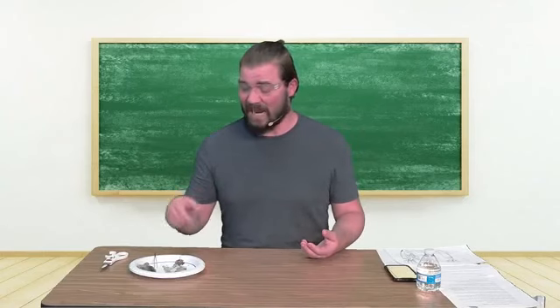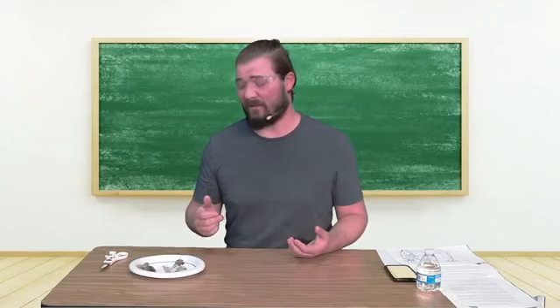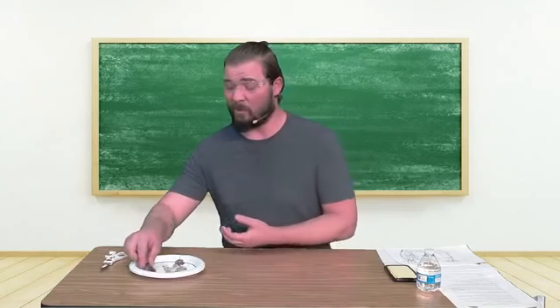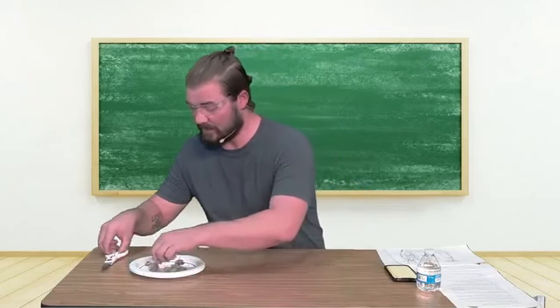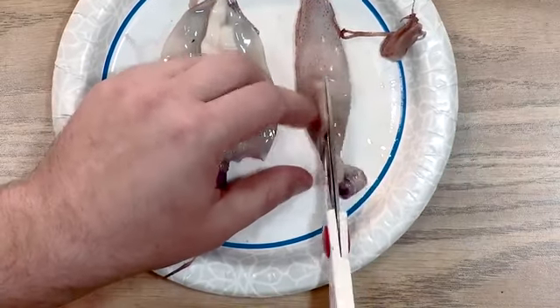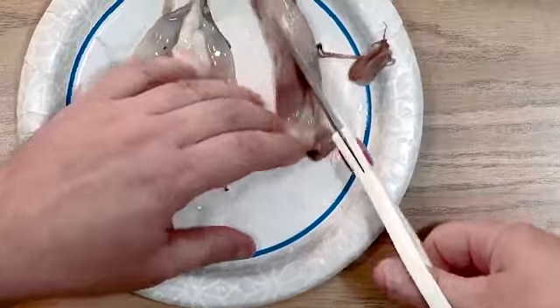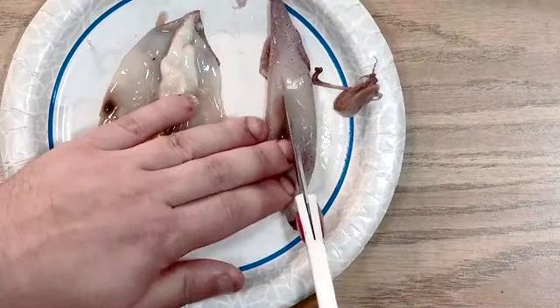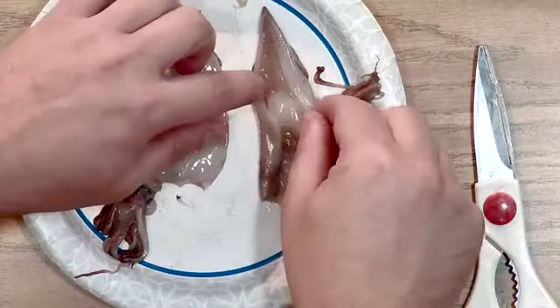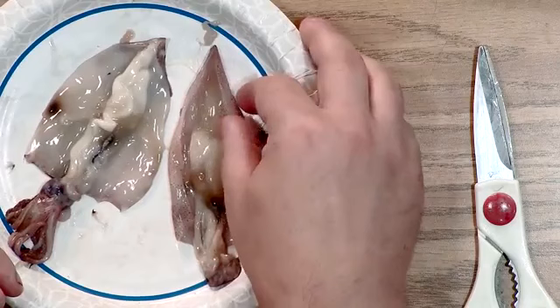All right, so I'm going to dive back in, and I'm really hoping that this second squid gives us a different look inside, maybe one male, one female. So same thing, I'm going to go to the lighter side, and cut into this, really hoping that we see something different. It's slimy. It's sliding around on here. It wants to get away. Yes! Totally different here.